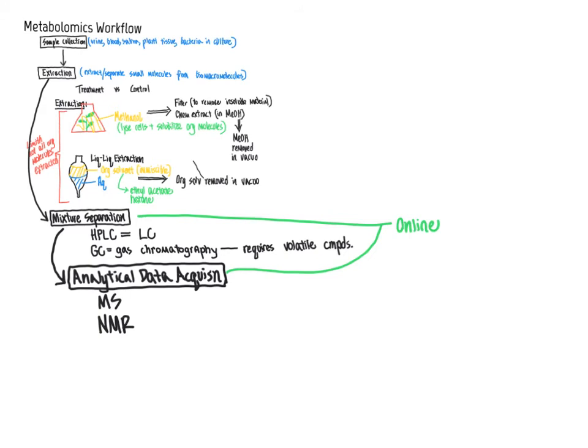As a result, proton NMR is most commonly used for the analytical data here. Occasionally, two-dimensional NMR data are also collected here, such as HMBC data or COSY data, to enable additional information about the structures of molecules that differ between treatments and controls.